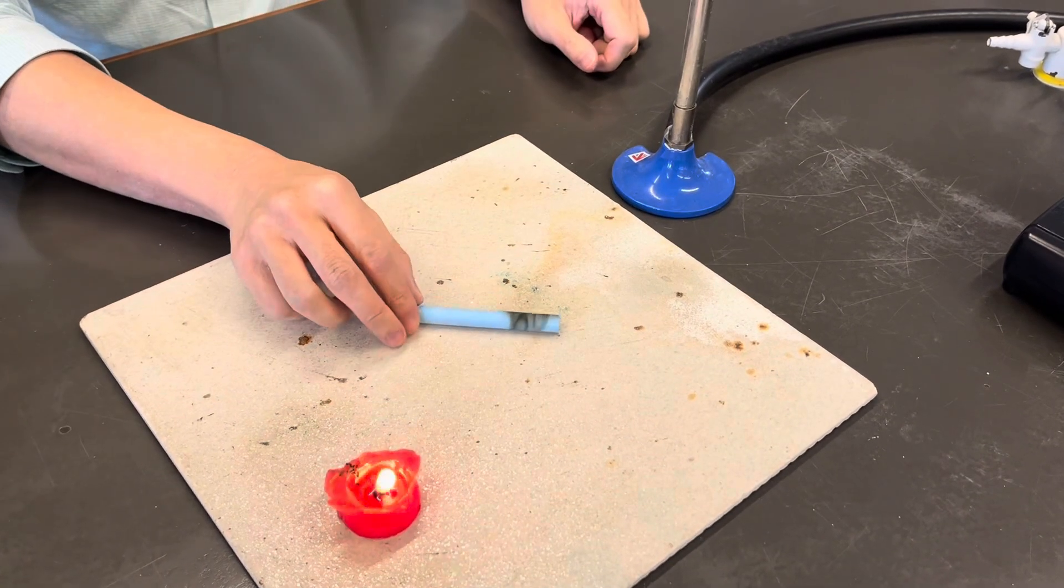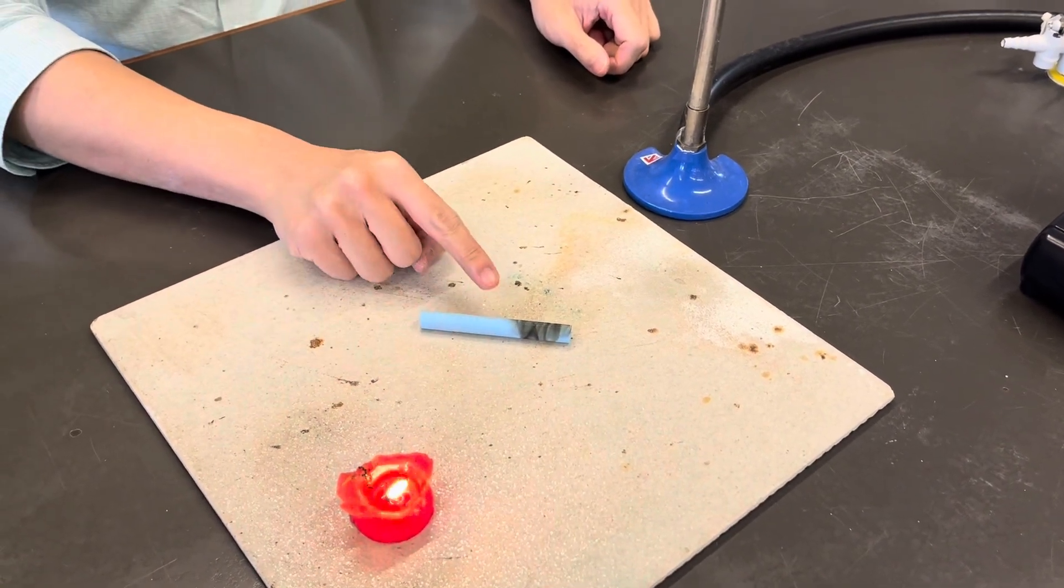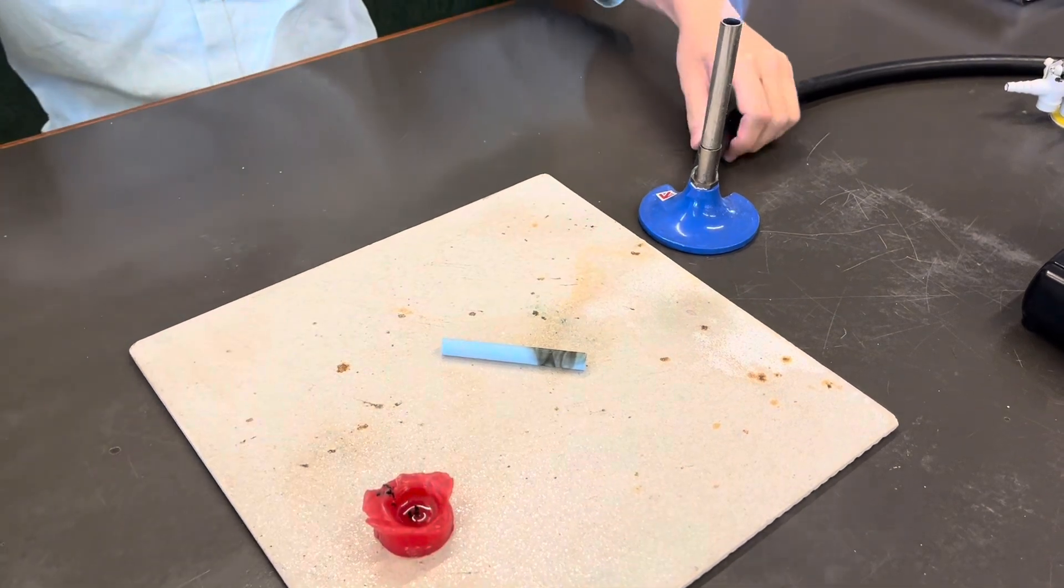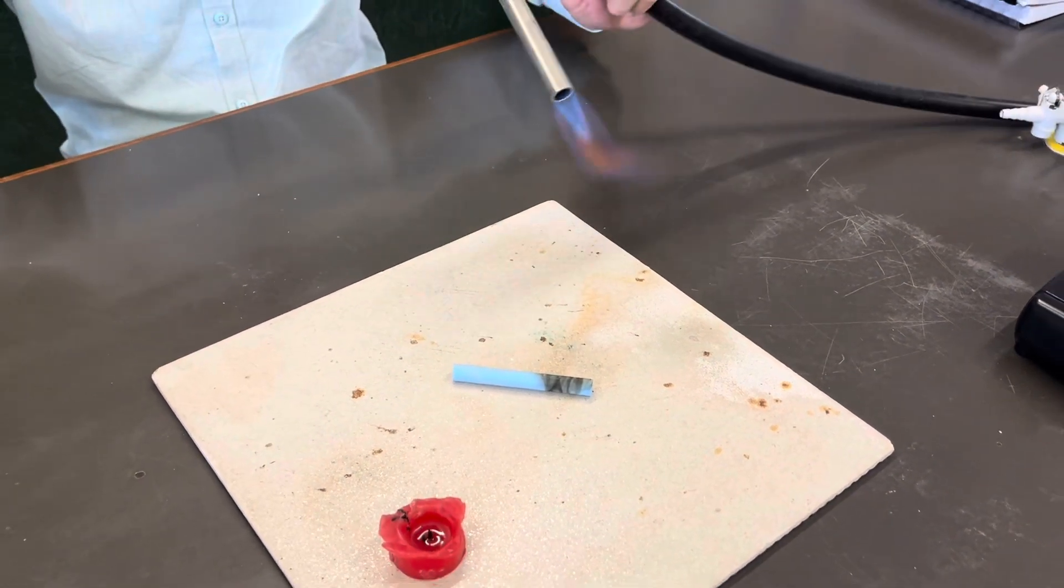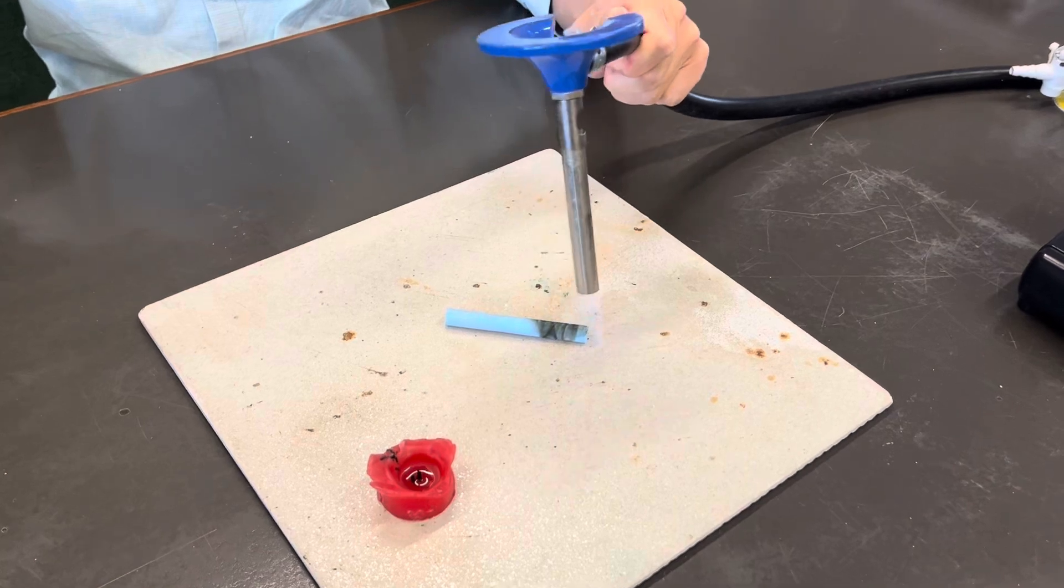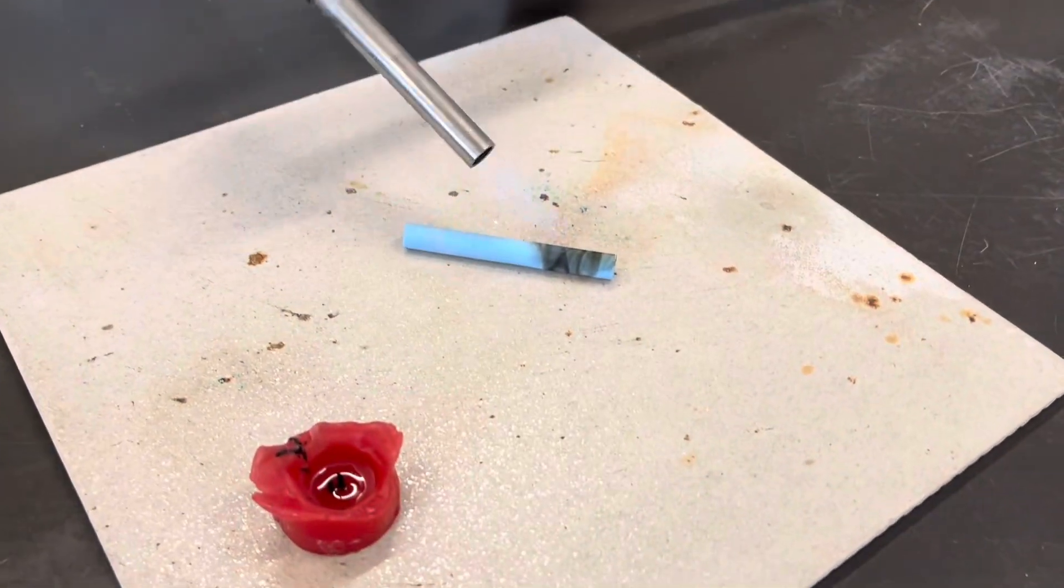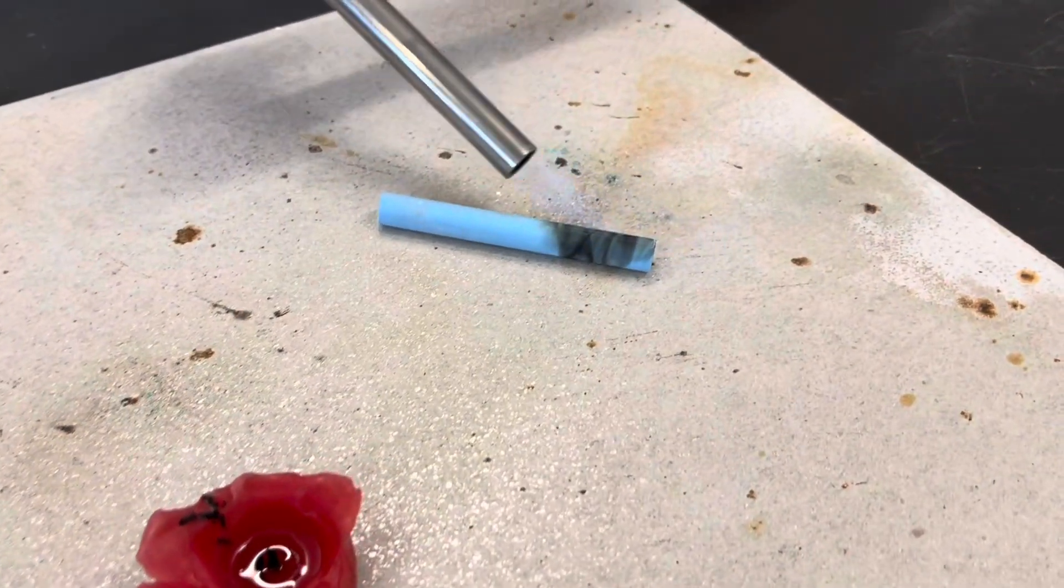So what I'm going to do right now is look at those black substances on here. I am going to use a Bunsen burner to heat it. Let's see.